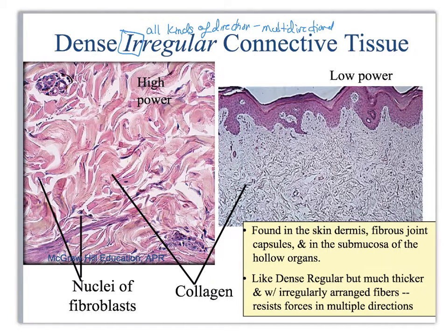All right. So in the slide on the left, I can see blank spaces, which is where my ground substance is. Now, if they put a black stain on here, we would actually see in reality that there are a lot of elastic fibers in here. I know this because I know what kind of tissue it is. Don't worry about that, but technically, you might think that this is a lot of white space, but it's not, because there's actually a lot of elastic fibers in there that didn't pick up the pink stain because elastic fibers don't absorb that stain.